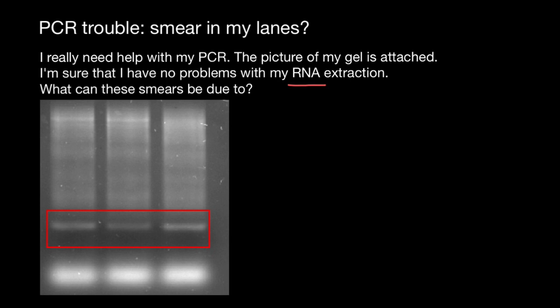Another explanation of what we see here is that during PCR, because primers were poorly designed, you actually got primer dimers. For those who don't know what primer dimers are — let me explain.